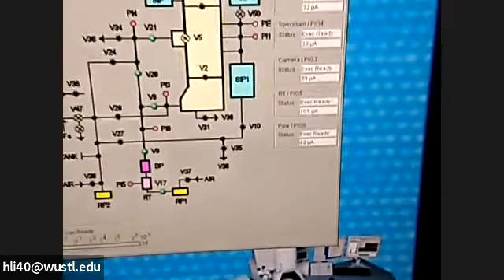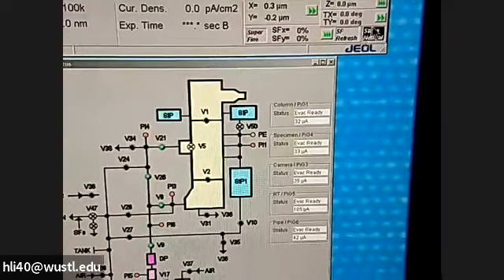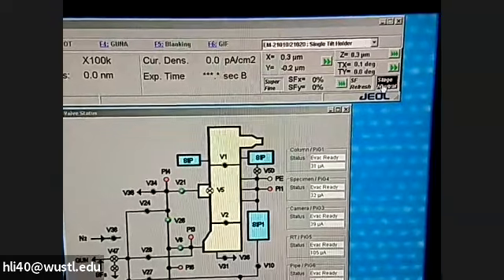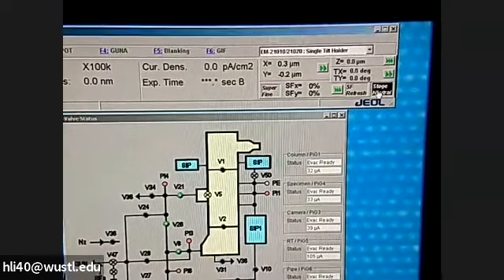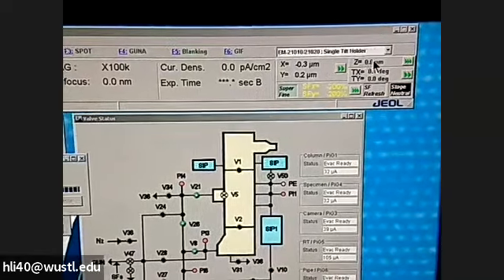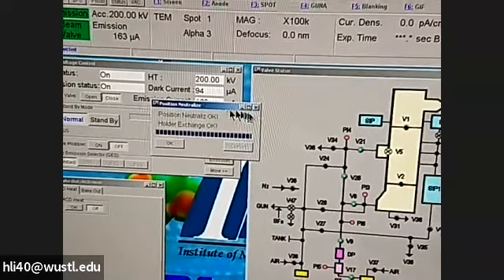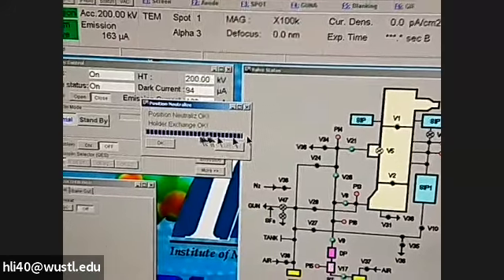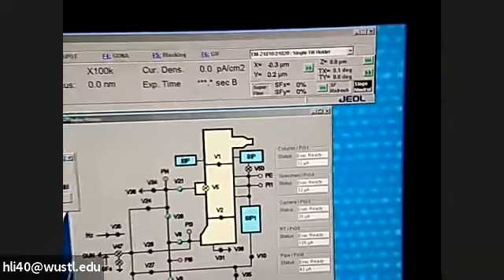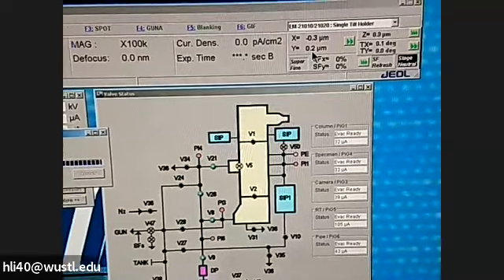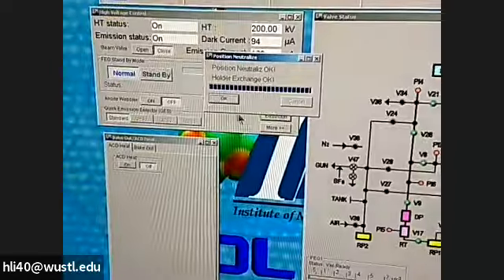While waiting, we need to neutralize the stage — double click stage neutral. Your position should come to XYZ 0. You will get a pop-up window telling you it will neutralize the stage. When it's done, all this will become blue, then click OK. If any of this number is above 0.5, you need to manually adjust. So simply click OK.